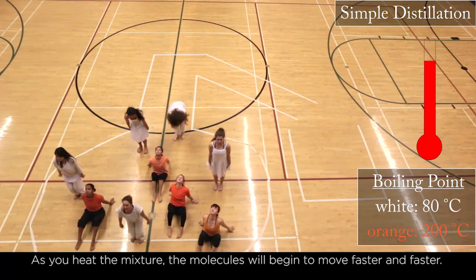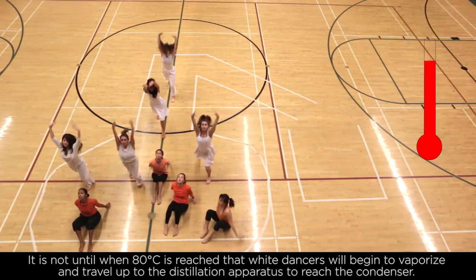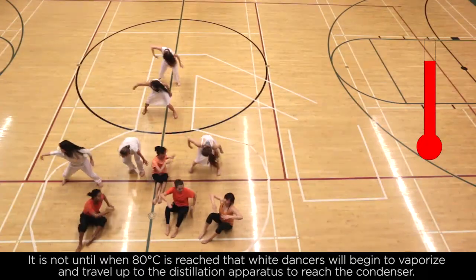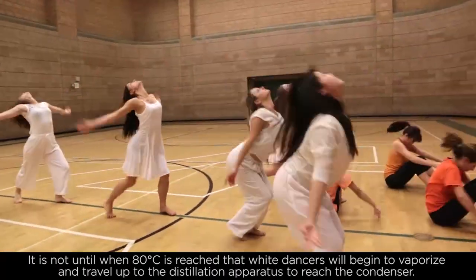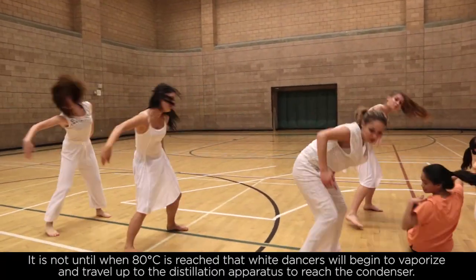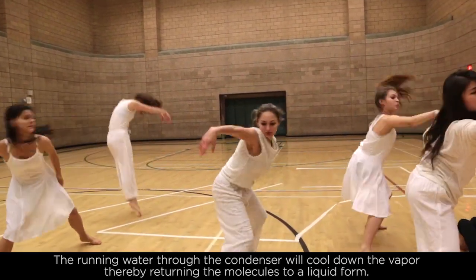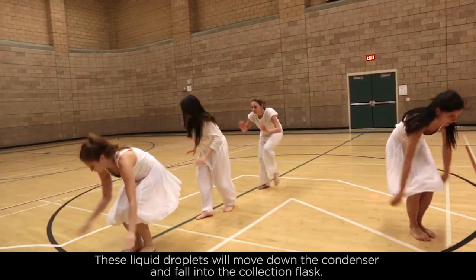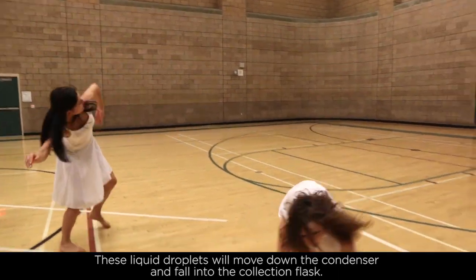As you heat the mixture, the molecules will begin to move faster and faster. It is not until 80 degrees Celsius is reached that the white dancers will begin to vaporize and travel through the distillation apparatus to reach the condenser. The running water through the condenser will cool down the vapor, thereby returning the molecules to a liquid form. These liquid droplets will move down the condenser and fall into a collection flask.